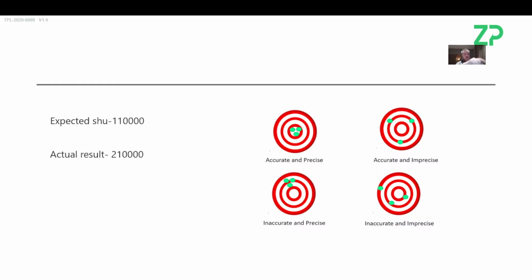If somebody makes an HPLC measurement of capsaicin, then at some point they have to have done a calibration on that HPLC. So when was that calibration done? Where's the data showing that calibration? If that calibration was done a few days ago, that's a problem. So people take those numbers and say, well, that's the truth. Is it the truth? I'm not entirely certain that it is.